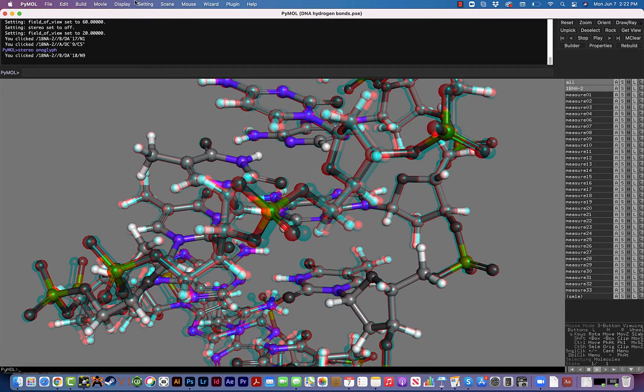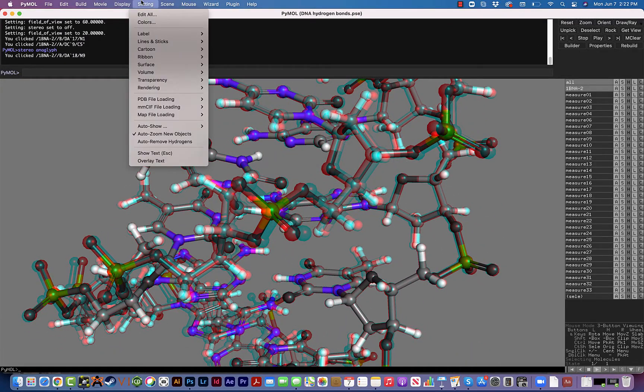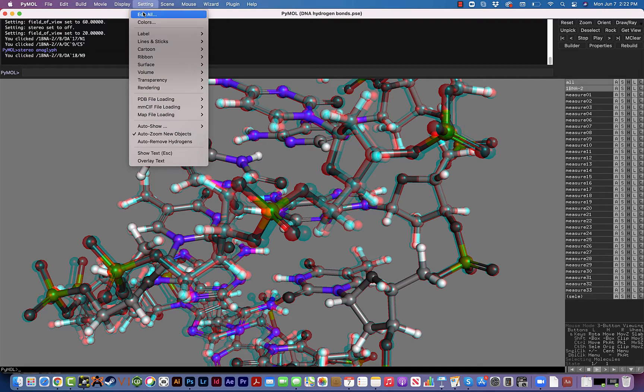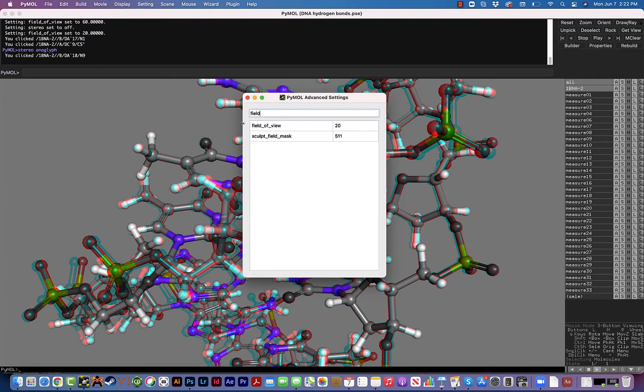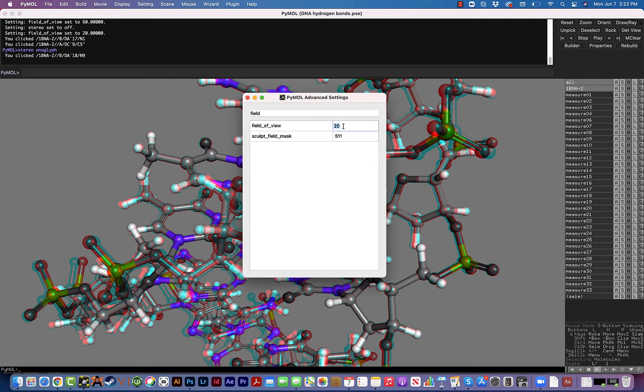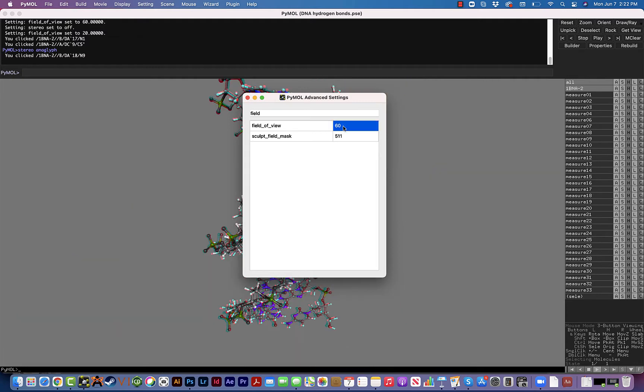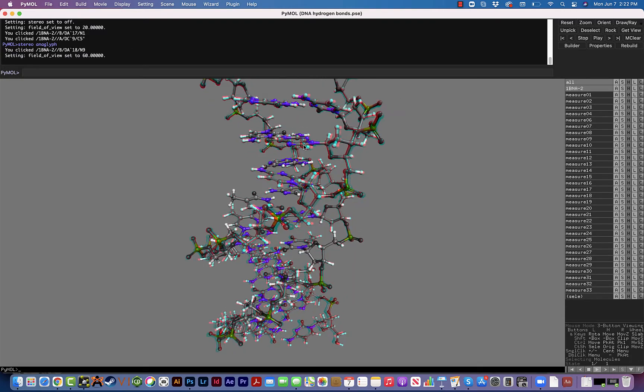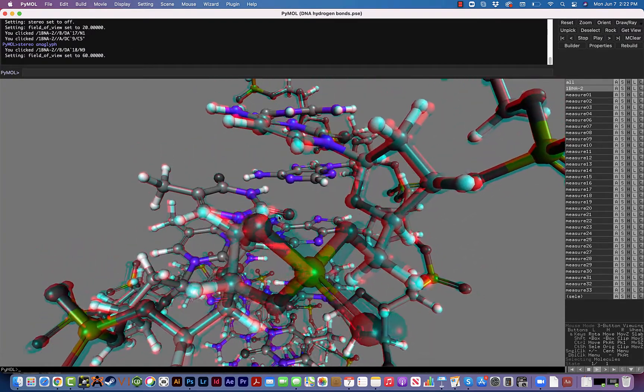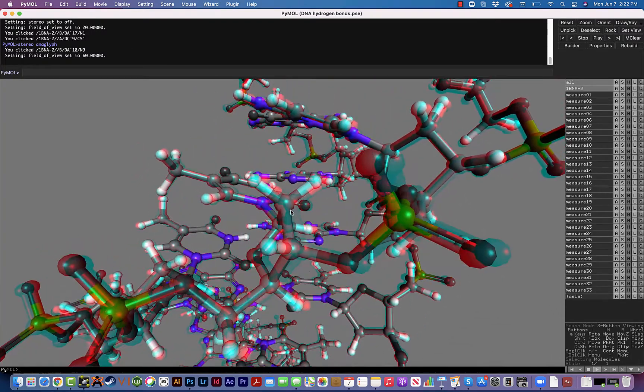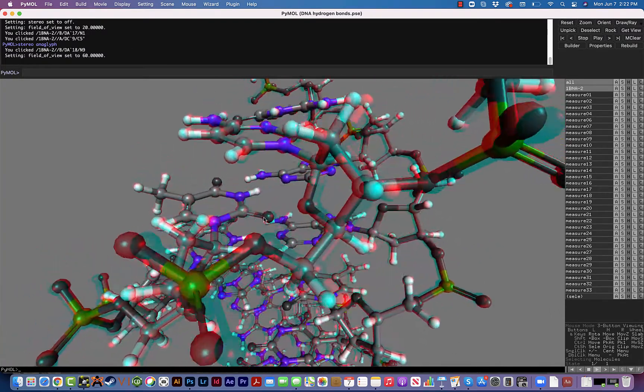Where we're going to go to now is under Setting, Edit All, just type in field of view and right now the field of view is set to 20. I'm not exactly sure what the 20 really represents, but if we increase that number to maybe 60, keep an eye on the background, it's going to change our perspective and actually enhance this 3D fisheye effect.